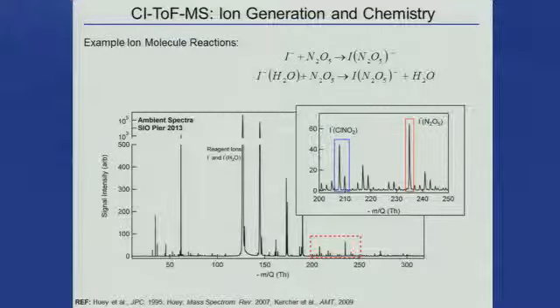And we also see the products, right? So this is I-ClNO2 here, and that's I-N2O5, so we get this in each individual shot. And this is a nice way of looking at reactant product pairs in the same instrument. So if we have any small biases in these measurements, we can correct for those.